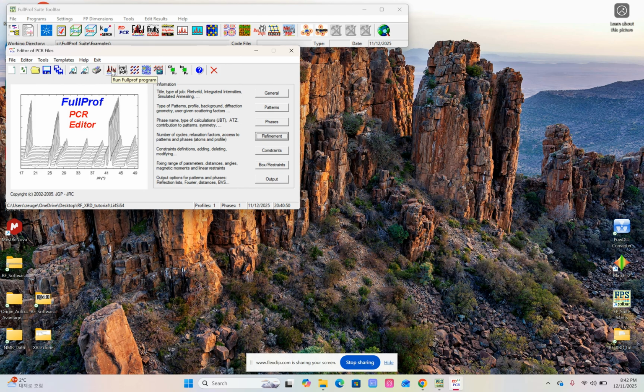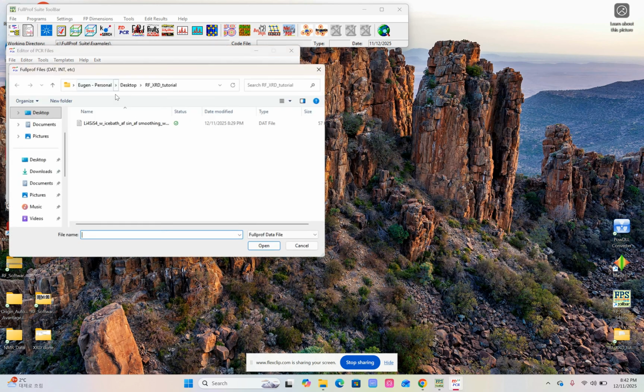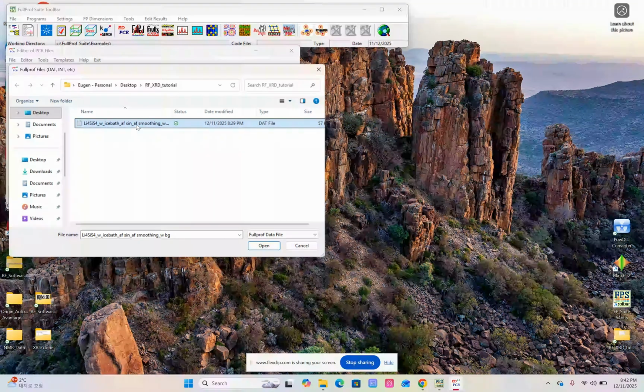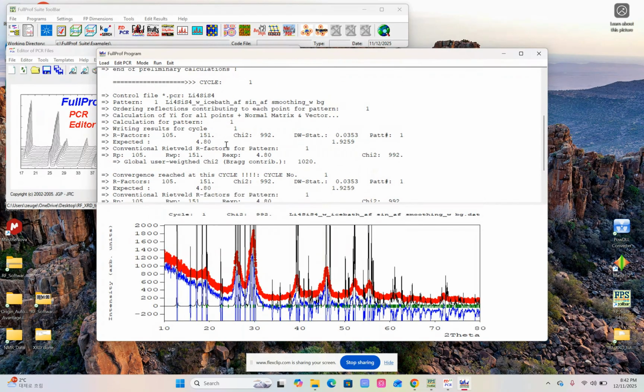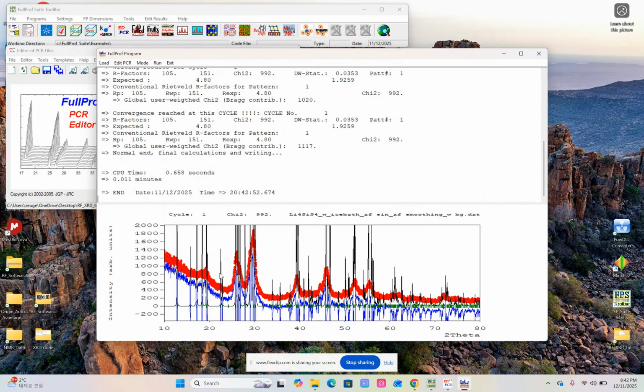But since we didn't select any parameters for a refinement, the plot itself will be awful. Anyways, I would like to show it to you because there is also one special feature which I also don't get why it's the case. Every time the software is asking you to confirm the data file. So you have all the time to select it, and here it's up to you. You can select it and go to open. I prefer just to double click it. And then we have already our refinement screen, and this is how our very first pattern looks like.